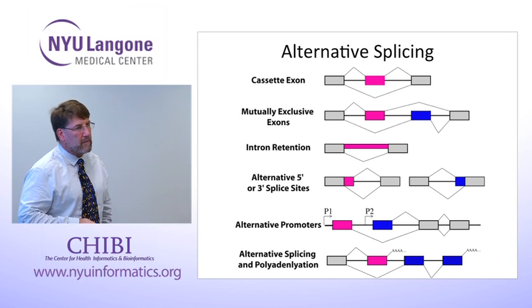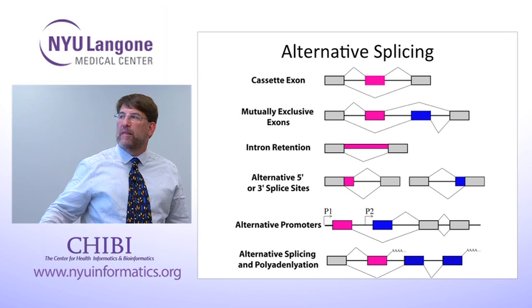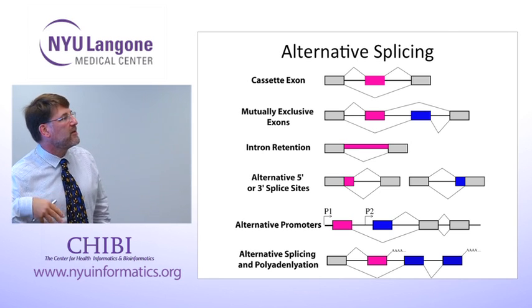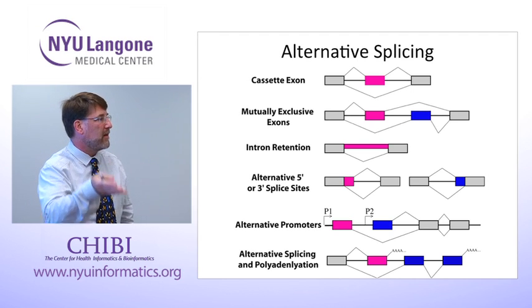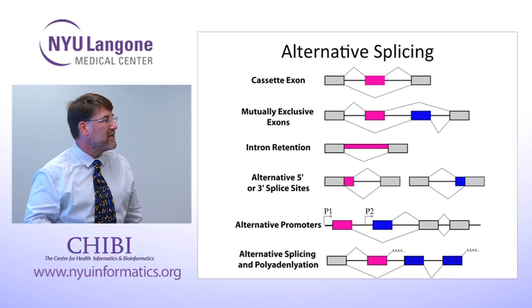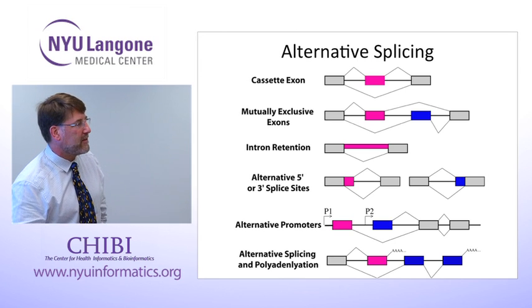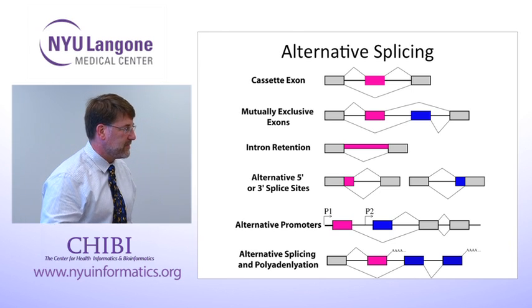This is even more problematic when I show you that coverage curve where there's 3' bias. Those areas of the transcript that are covered poorly are also going to be covered erratically from one sample to another, and so you're going to find a transcript shows up in one sample and not in another, and that's going to be called as differential expression by any reasonable algorithm, but it's not reproducible. So this is causing us a lot of struggle, and it's not my favorite experimental design. Find me any exon that changes expression in my sample.